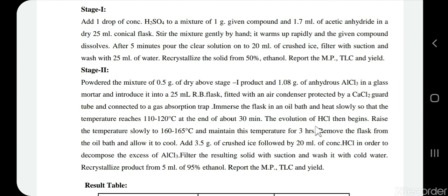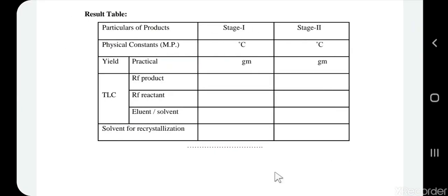We check the TLC before workup. Once TLC shows completion of the reaction, we quench the AlCl₃ by carefully adding 4–5 grams of crushed ice and 20 ml of concentrated HCl to decompose the excess AlCl₃ — it is an exothermic reaction, but the quantity of AlCl₃ is very small so it can be done carefully. We then filter the product, 2,5-dihydroxyacetophenone, wash it with water, and recrystallize from 5 ml of 95% ethanol.